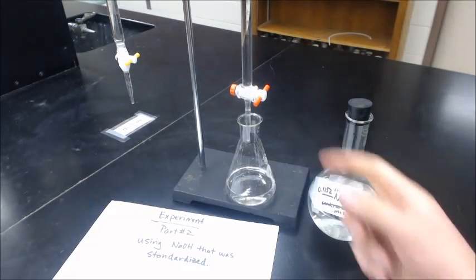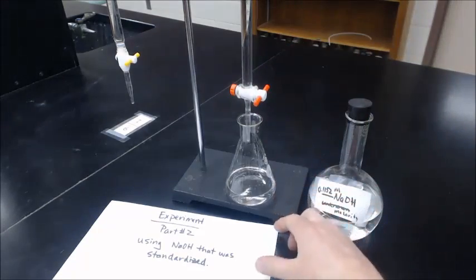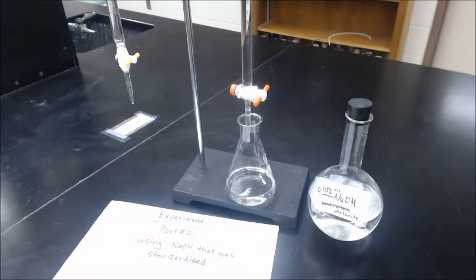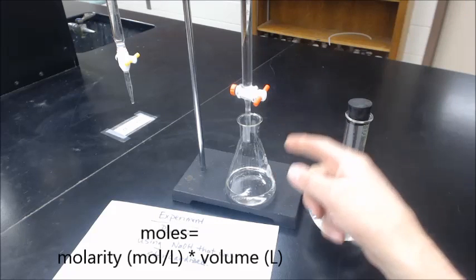At that point, you'll know the molarity of sodium hydroxide. You'll know the volume that you've dispensed in, so you'll know the number of moles of sodium hydroxide that went in there.